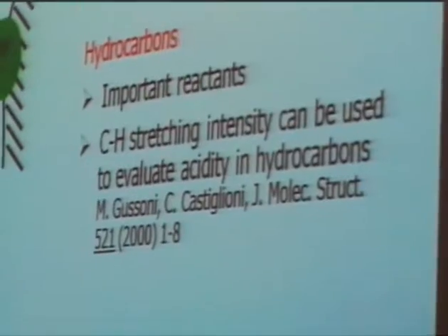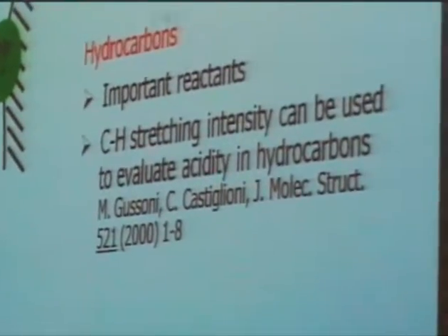For these acid catalysts, of course, the interesting reactants are hydrocarbons, and I would like to point out that there's actually some very interesting literature by Gussoni, Castiglioni, and also Zerbi, a series of papers where they have just looked at the free molecules, and they have found that one can use the intensity of the CH stretching vibrations as a measure of the acidity of the hydrocarbons, which is in principle consistent with our considerations.